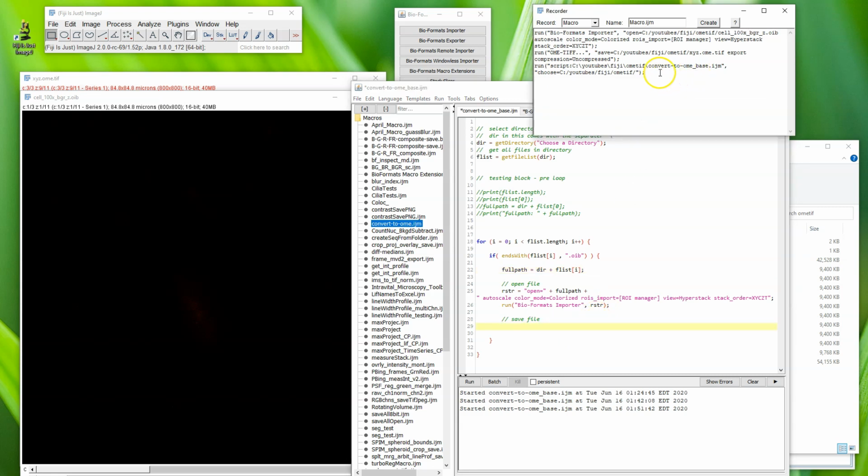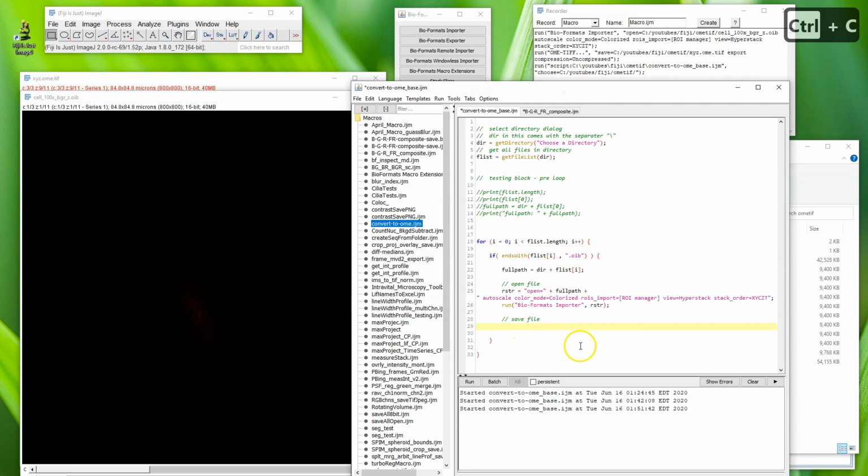And then on the save file, we're going to do this point here. We're going to copy this, sorry, wrong one, the ome.tif. And we'll drop that in there. We're going to do exactly the same thing, so just cut that out. And we're actually going to do something slightly different now because we have the problem of having to change the file name to be .ome.tif on the end. So what we have here, we're just going to put in what we pasted so we don't lose it. I'm just going to cheat and pull in from a different file, but let's just copy it over.